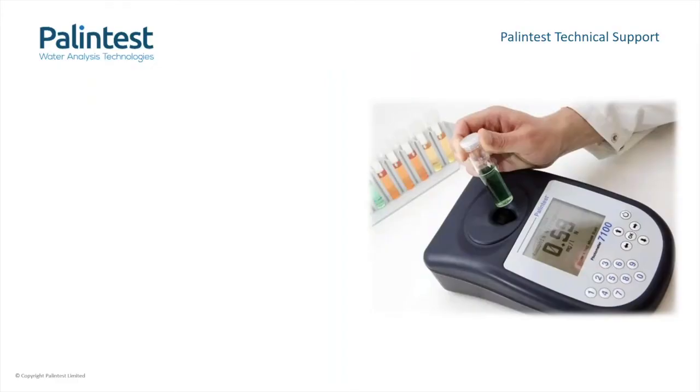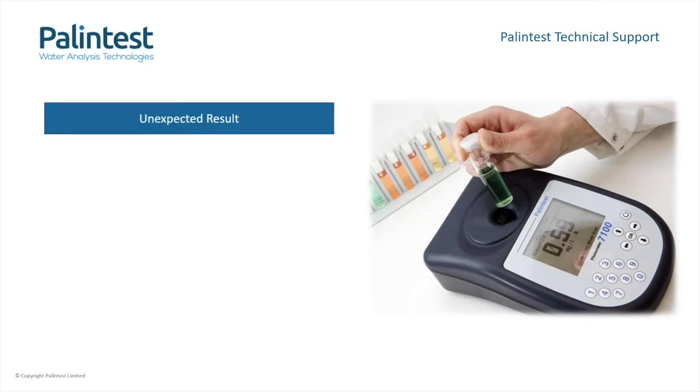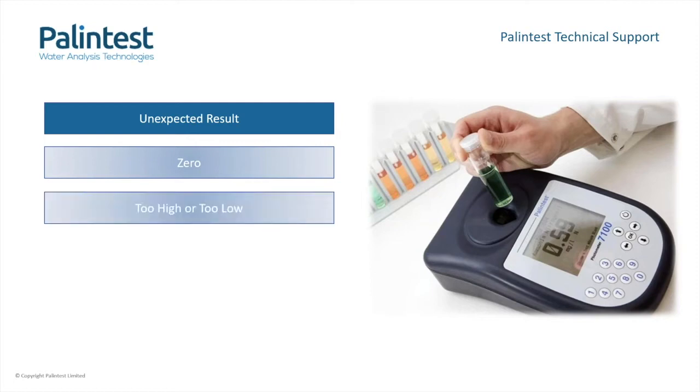Now, many of our technical support conversations begin with one of our customers getting an unexpected result on their photometer. They may have a zero value for a concentration when they are convinced that there is something present. The value may have been too high or too low compared to what they expect. Or they may have received an out of range or error message on their screen.